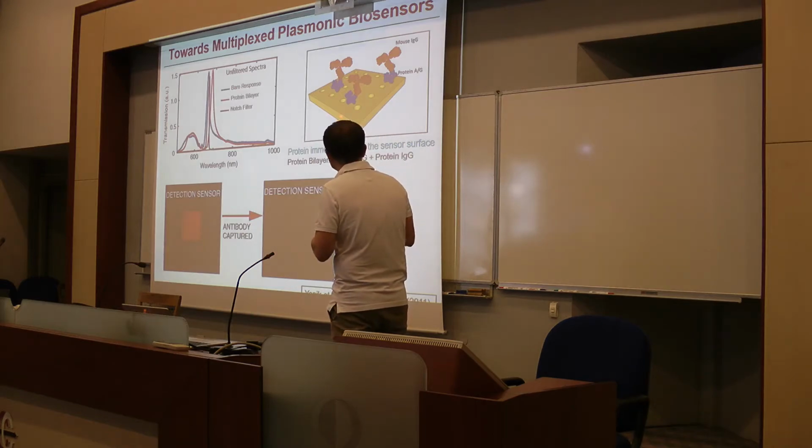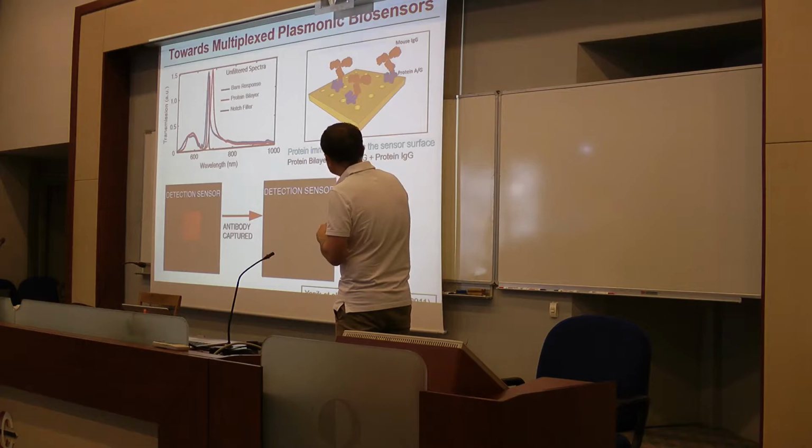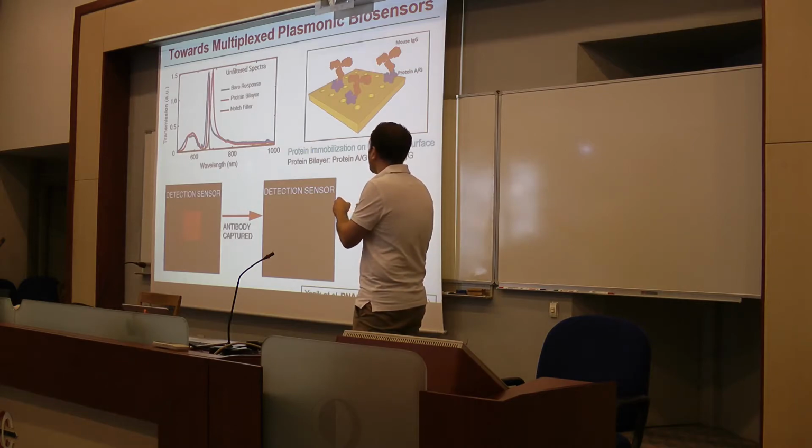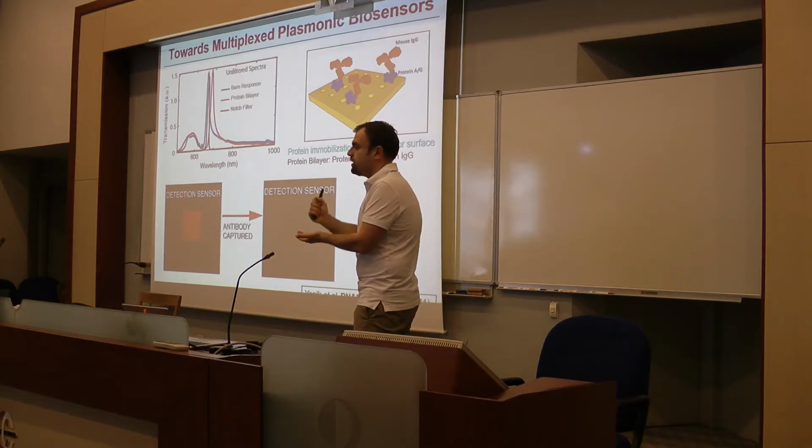So for example, here we have again a plasmonic chip whose response overlaps with the light source. That light source has been filtered with a notch filter, and when something binds on the surface, here a protein, AG plus IgG, it shifts toward longer wavelength, so the light and the EOT signal do not match. So when nothing is on it, you see a bright intensity. When it shifts toward longer wavelength due to the protein binding, you see nothing. So that shows that something is sticking on the surface, the protein AG and IgG.